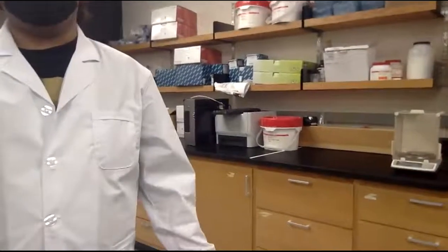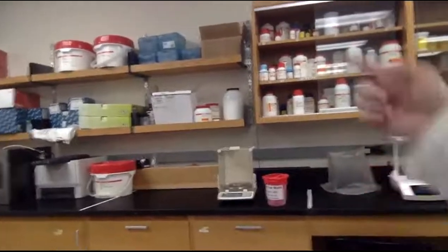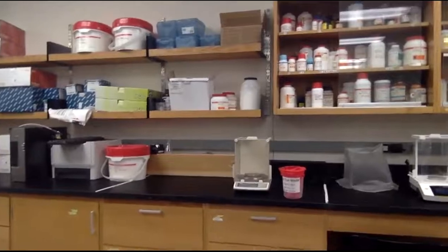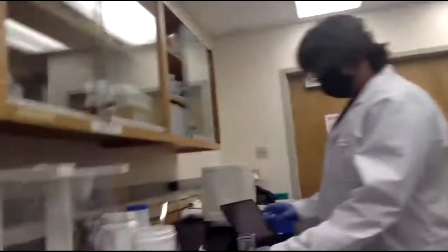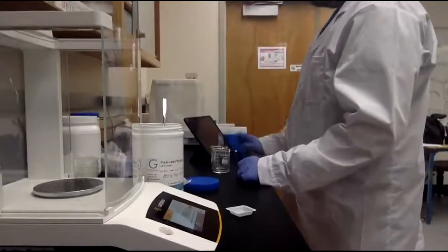So we just want to add sodium hydroxide to it and do that one first, or you prepare 3 buffers first. Okay. Then you measure the pH. Then you test the capacity. That makes sense. We do the second guy. Use the dibasic, 0.87 grams of the dibasic.